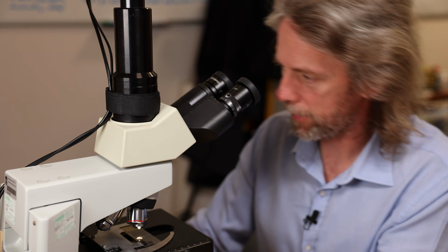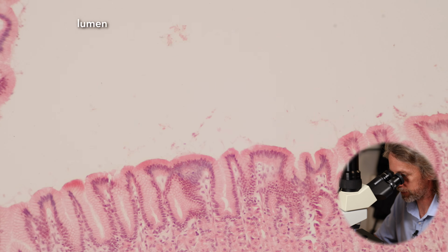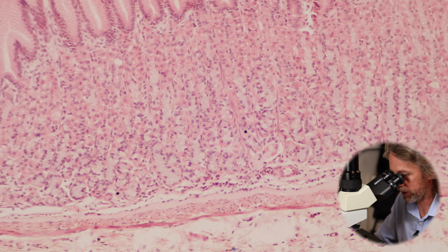There's my wheel. There it is. What do you think of that? So that there is the lumen. That's inside the stomach. That's where the food would be. That's the epithelium that's up against the food. And then we've got all this underneath it. Can you spot the muscle layer there?